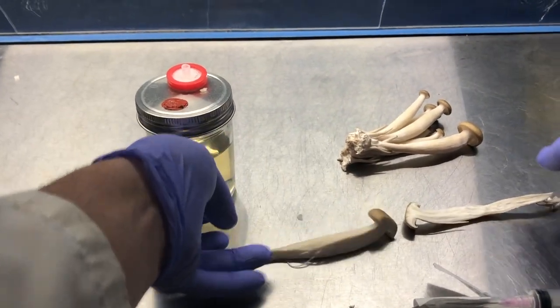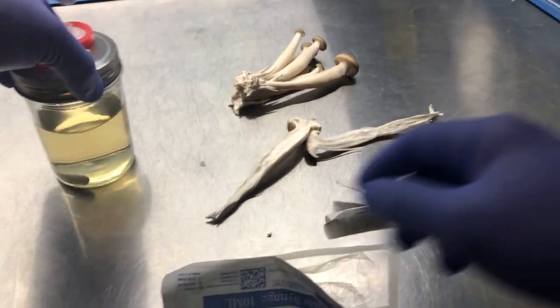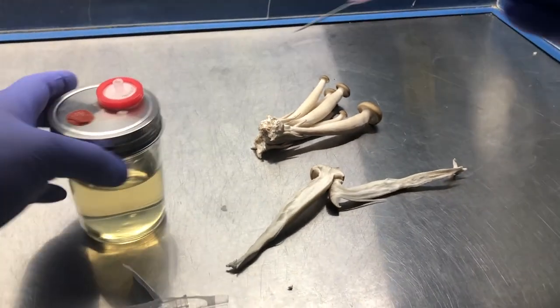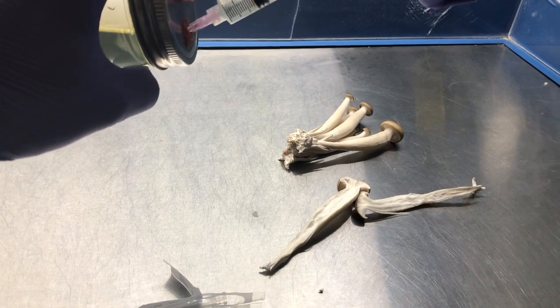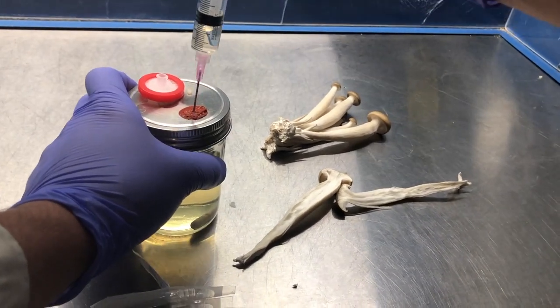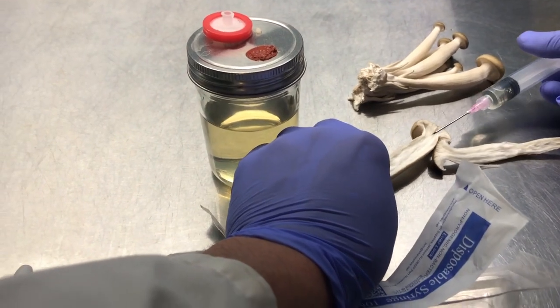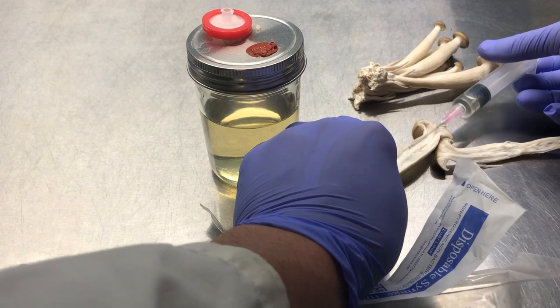So looks like that's a really good spot. And with this, you only have one shot. So I'm gonna try to start by priming the pump. So I've got a little bit of liquid for some force. And then you're just gonna wanna slide your needle.